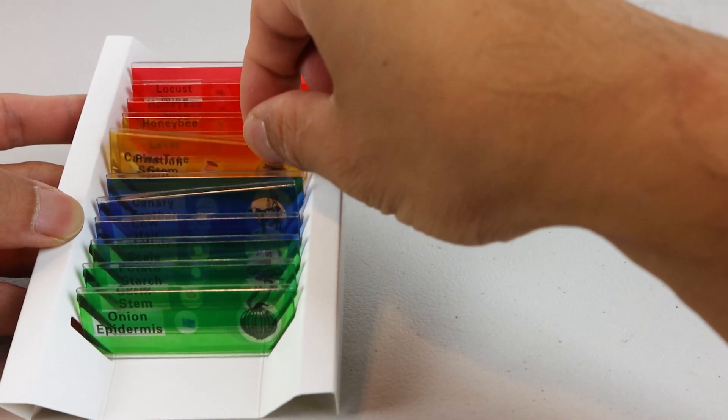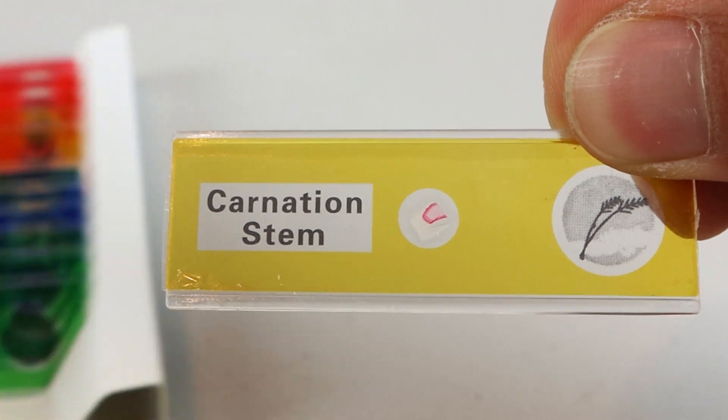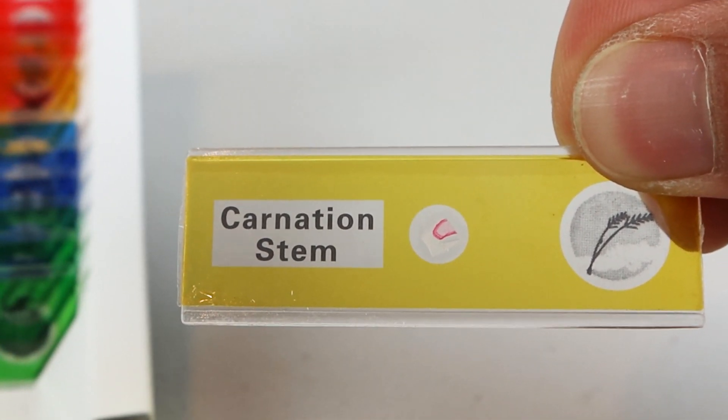The sets included with the microscope are random, and mine contains samples from both plants and animals.